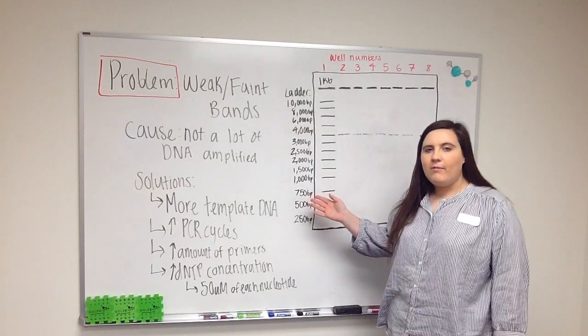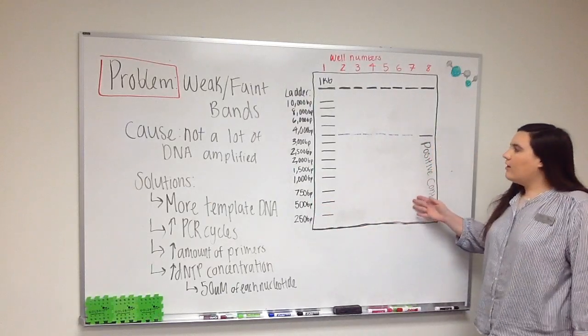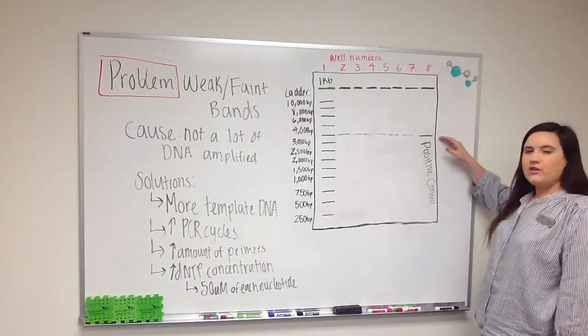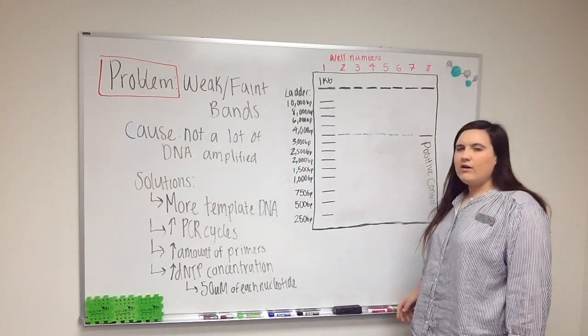The next common PCR problem we're going to be discussing is weak or faint bands. How this will look on a gel is that you'll have some amplification of the desired product but the bands might be weak or faint and it's hard to see them on the gel.